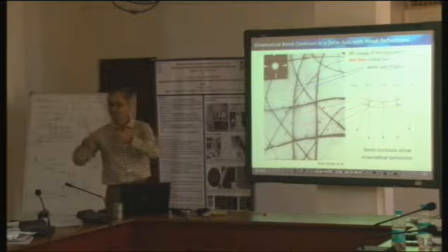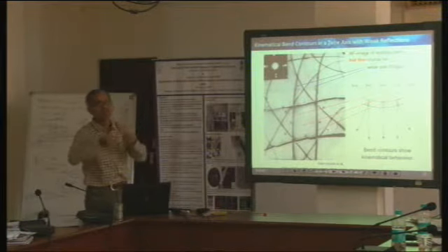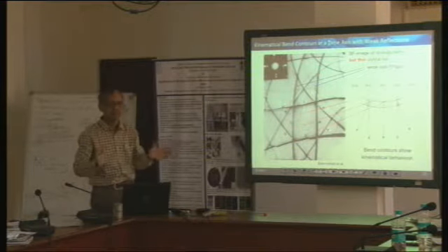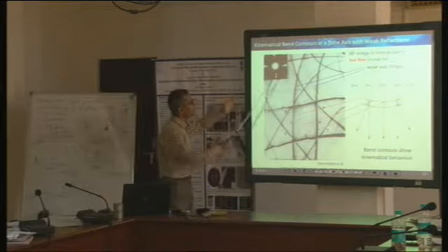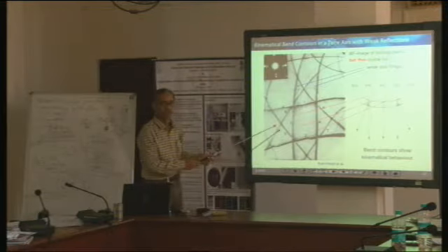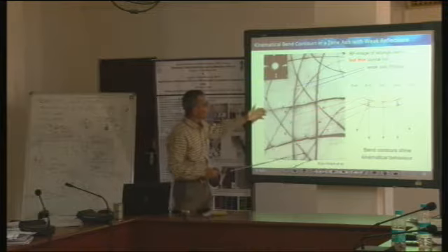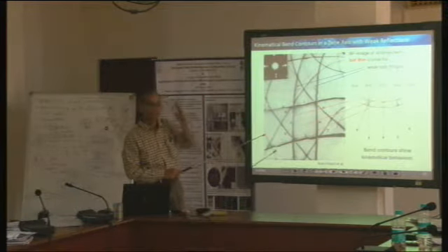Only on very few occasions, when we have a deliberate intention, do we make a dark field image. But a bright field image, more or less, we are always in bright field. In a bright field image from a thin area you get this kind of structures, and these are actually the bend contours at thin regions of the sample. But this is bright field, it's not dark field, so you have to make that understanding.